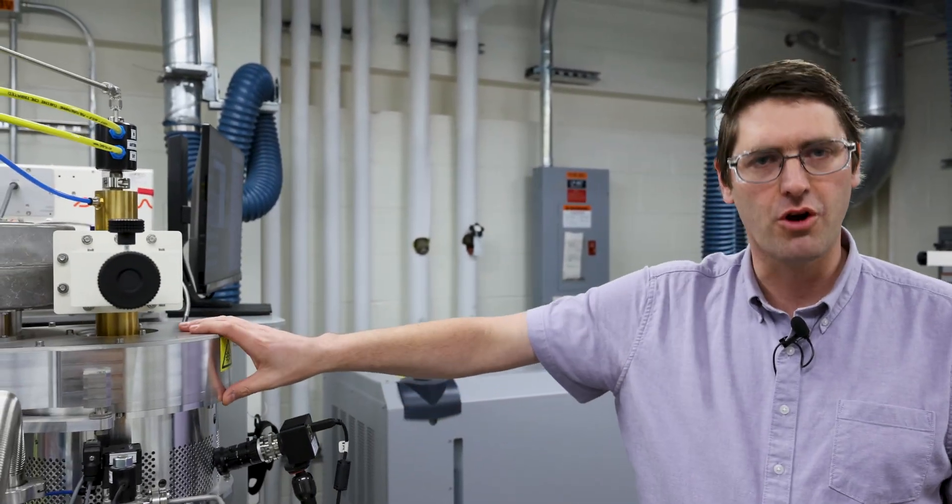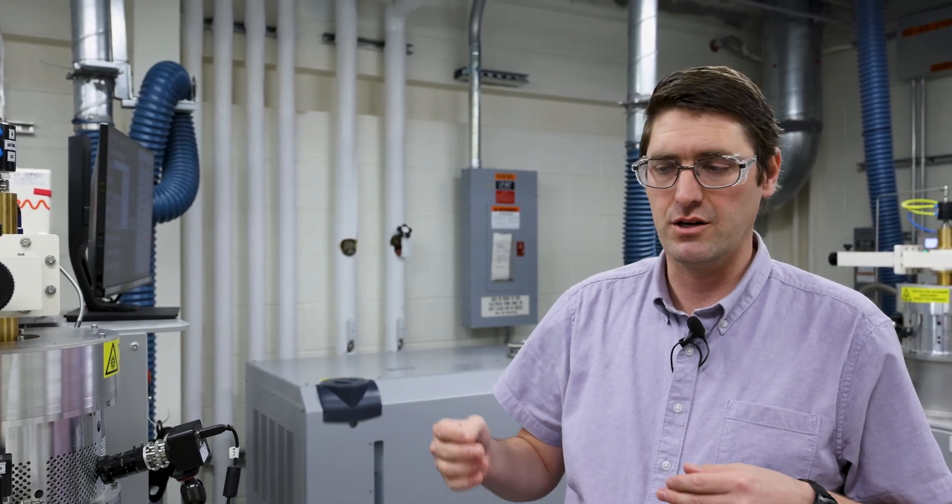Welcome to the lab. Here we have three diamond growing machines that use plasma generated with hydrogen and carbon inside the chambers. They're used to grow diamond layer by layer, extremely pure, for technological quantum and microelectronics applications.